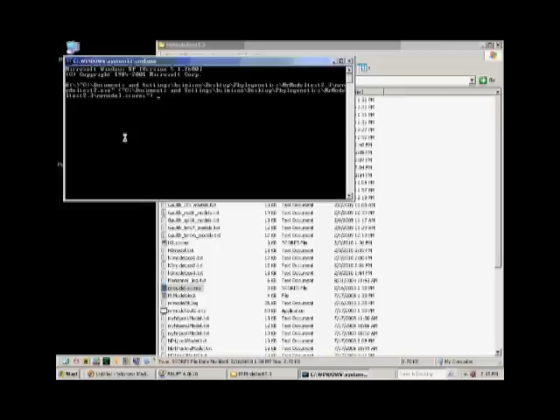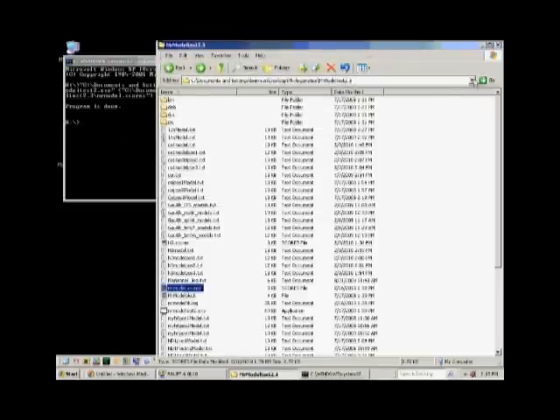and create a space after that and provide a name that indicates what your model is. I call it my CO1 model.txt. Hit enter, and it tells you right away that the program is finished and that it stored it in the H drive. So let's go have a look at that file.